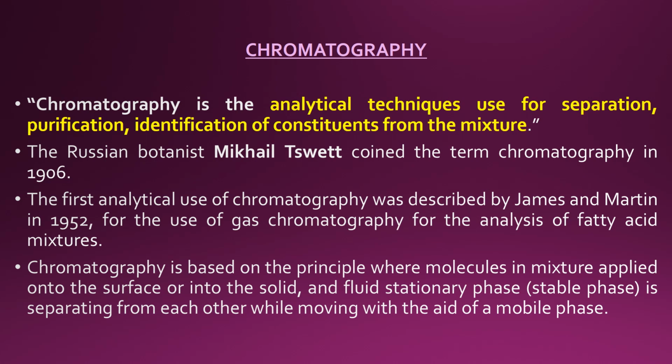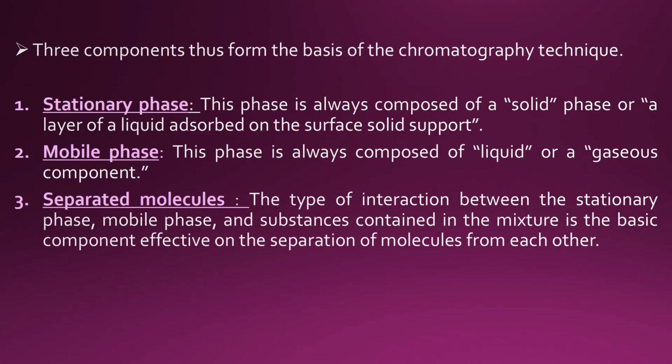Chromatography is based on the principle where molecules in a mixture applied onto the surface or into the solid and fluid stationary phase, that is the stable phase, are separated from each other while moving with the aid of a mobile phase. Three components thus form the basis of the chromatography technique.